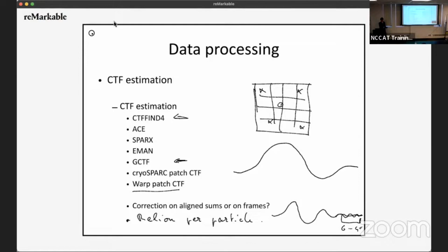Okay, can't go below X. And so far it looks like we can definitely go below 1 micron defocus, probably pretty close to 0.5 micron defocus. But where exactly you start to lose alignment accuracy, which basically throws your resolution out of the window, I don't know. I was actually discussing with my postdoc doing some experiments along those lines, but we haven't done them. So if someone wants to do them, I'd be interested in the result too.